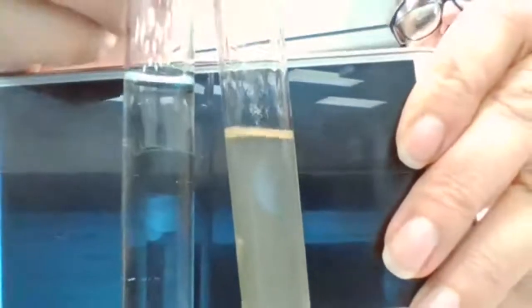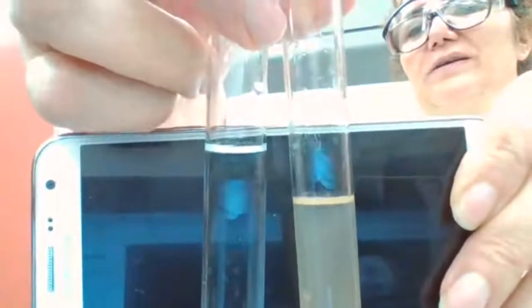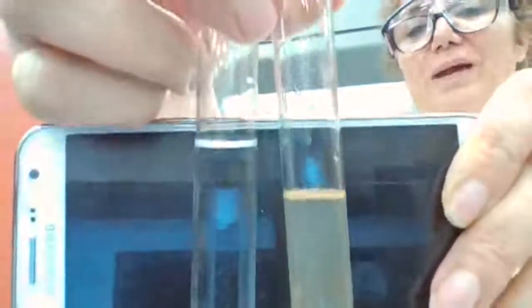When you compare with the blank, which is the water, it makes it easier to see it's cloudy, but it's not the best, and it's not the fastest. It's not like adding 2,4-dinitro, which you did for the other aldehydes and ketones yesterday, where you saw the precipitate right away.